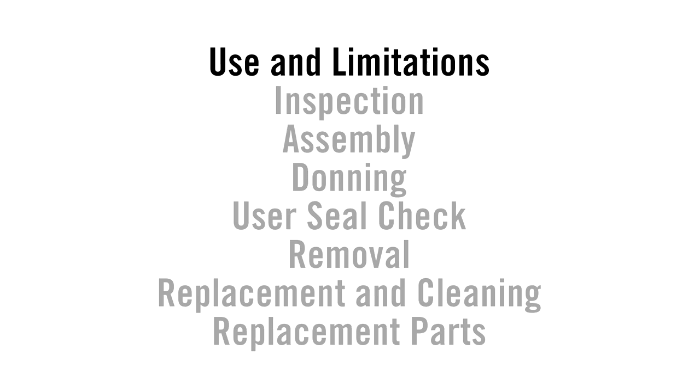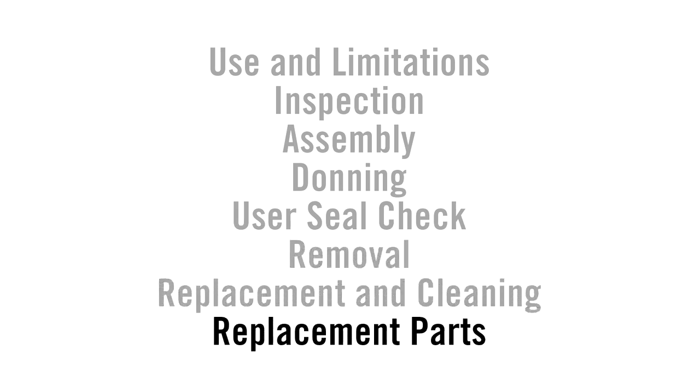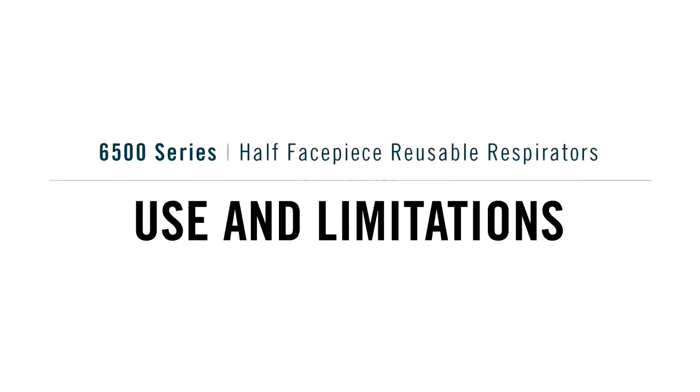We will be reviewing and instructing in the following 7 areas: use and limitations, inspection, assembly, donning, user seal check, removal, and replacement and cleaning.